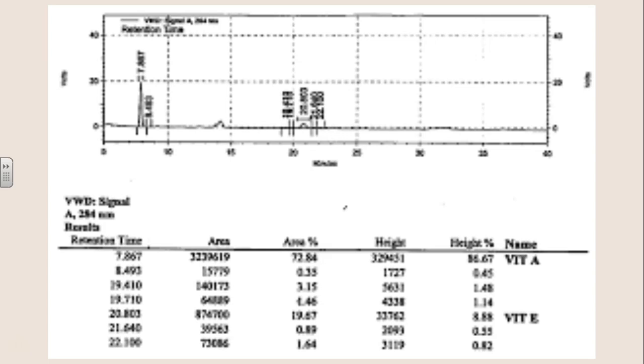And then the retention time also can give you a little bit of an idea of what the identity of the compound is. Okay, so knowing that polar compounds are going to come out a little more slowly, smaller compounds come out a little more quickly, and things with lower boiling point are also going to come out a little more quickly. So that's your little lab primer on GC and what GC is used for.